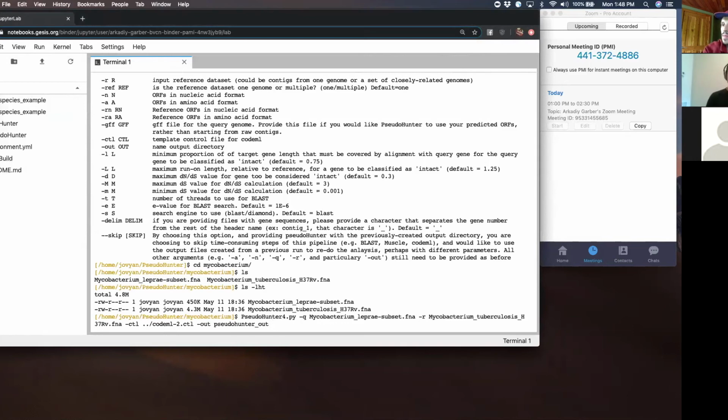It's not just that when you're fully saturated, any mutation you get is going to be a second mutation that may be a back mutation. But most of these models rely on this idea of infinite sites, where the possibility of getting multiple mutations at the same site is 0. And so if you're getting close to saturation, that means that you could still potentially have these multiple mutations. And so you want to be pretty careful there. Okay. Well, then let's set it to 1. Let's be a little bit more conservative.